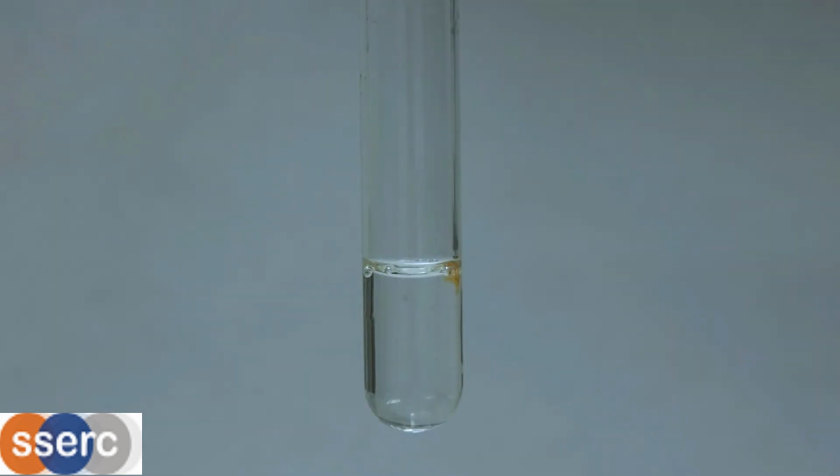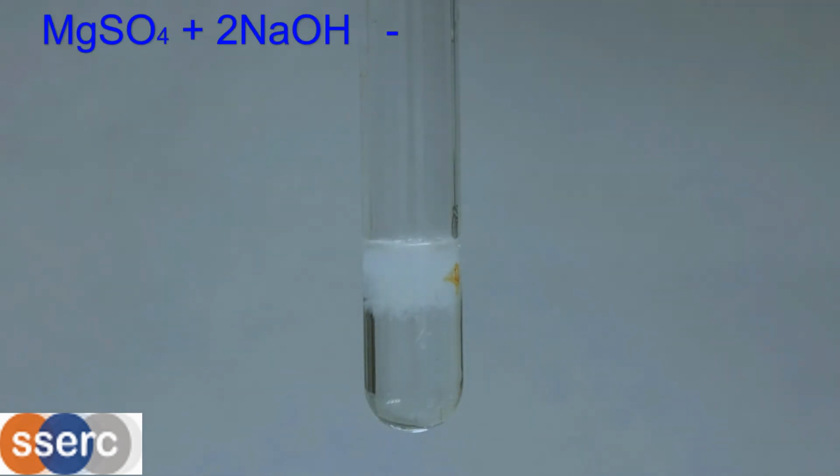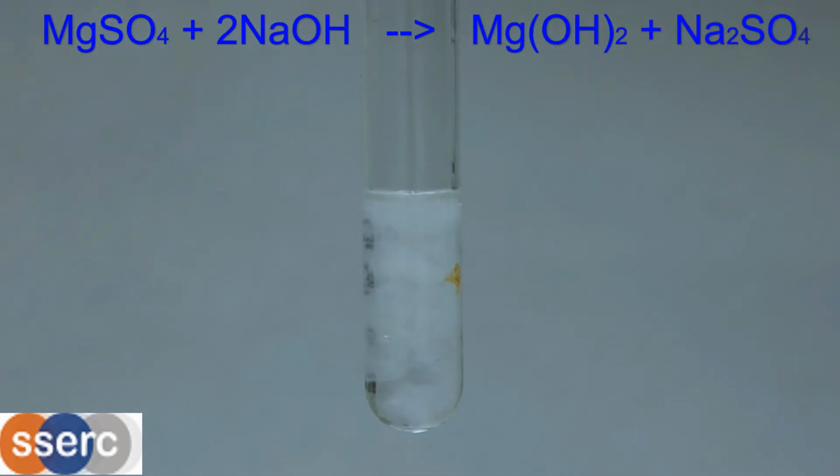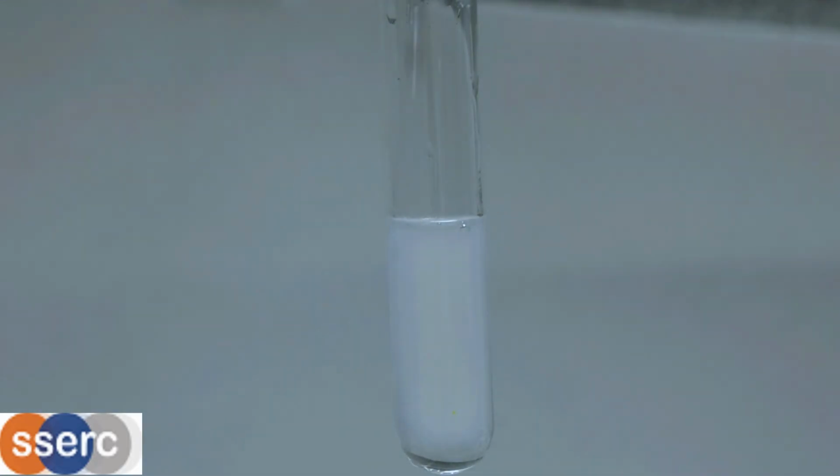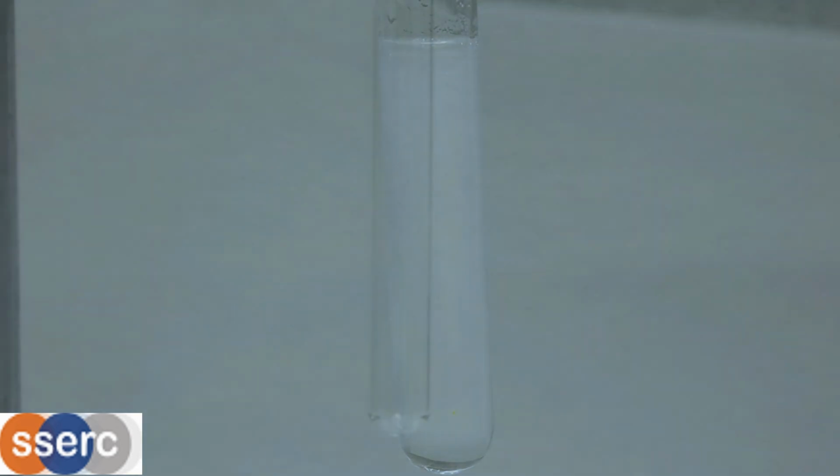Magnesium, like the previous two, gives a white precipitate. This time it won't dissolve in excess sodium hydroxide. With ammonia, this time the white precipitate remains when you add excess. Magnesium hydroxide is not amphoteric and does not form a complex either.